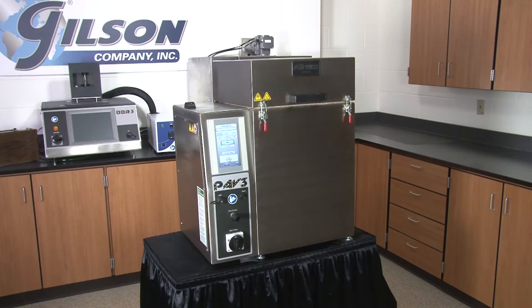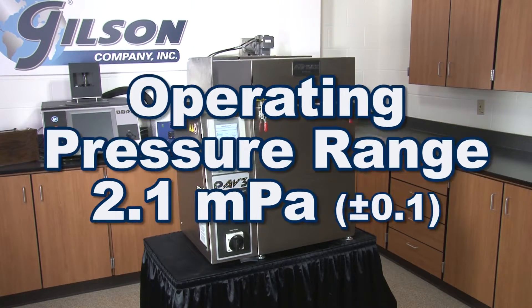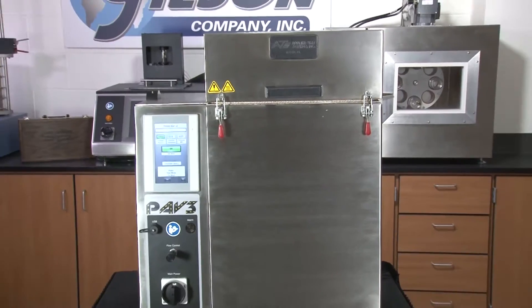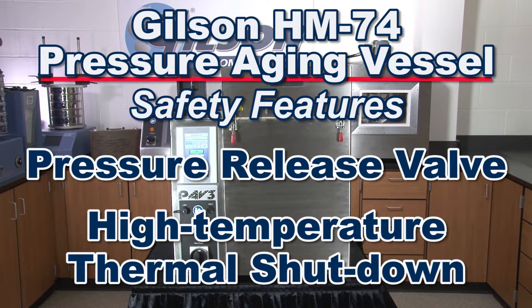The Gilson HM74 has an operating pressure range of 2.1 MPa and a temperature range of 80 to 115 degrees Celsius. A pressure release valve and high temperature shutdown switch are included as standard safety features.